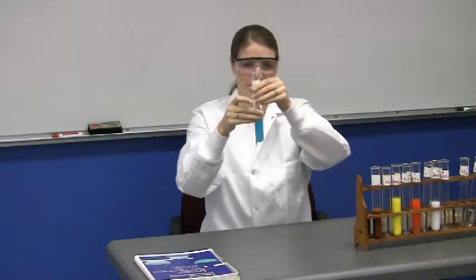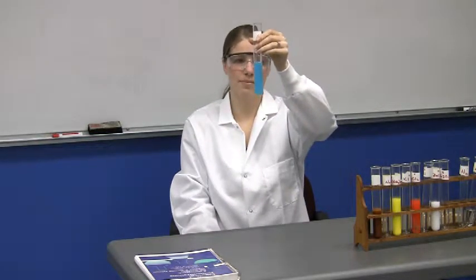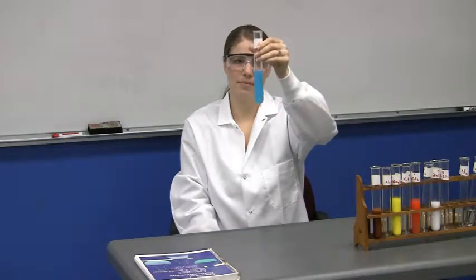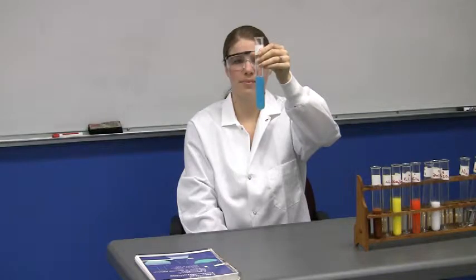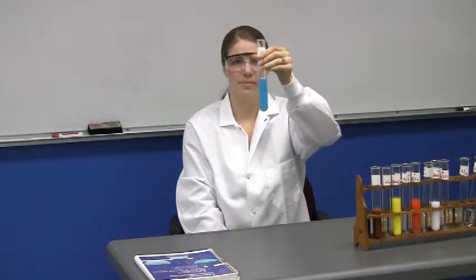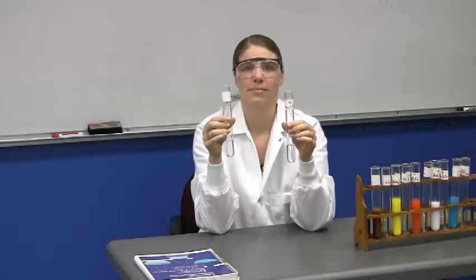Now, because the color was blue before mixing, it's a little bit hard to tell if the precipitate that you see is blue or if it's just because of the blue solution. The answer to that question hopefully will be after we let the precipitate settle for a while. Okay, that's our fifth of six, and the last pair of test tubes is going to be mixed now.